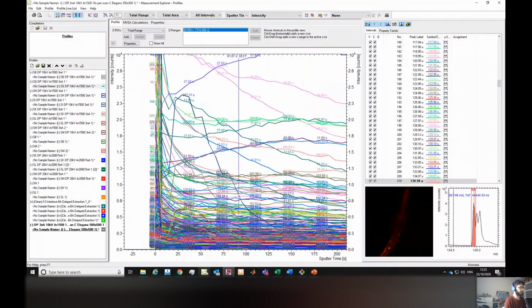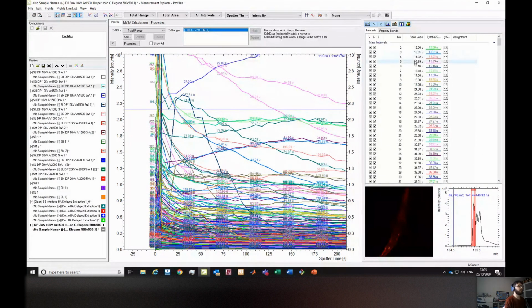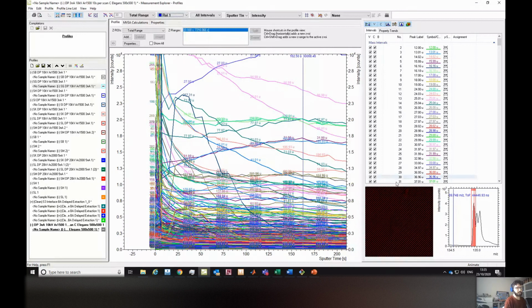So we move, as I said, this is a 3D data set. So we have depth information. So you see all the ions applied in as we had for the other ones. But before we do the export, you come here at the top, you have all these drop-down menus. One of them says total area. You click there, and you see all the lists, the list of regions of interest you just created. So I will go ROI1. You can see here on the bottom right that it shows a tiny square that we created.